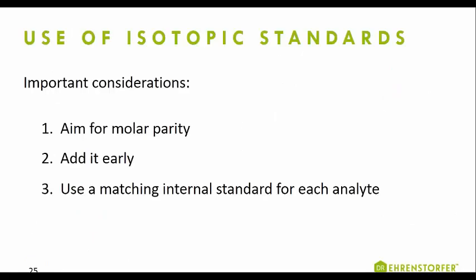Okay, so finally, once you've selected your internal standard, I'd like to just mention 3 important considerations when using it. Keeping the concentration approximately equal to the expected analyte concentration, adding it early, and only applying the internal standard correction to the appropriate analyte.